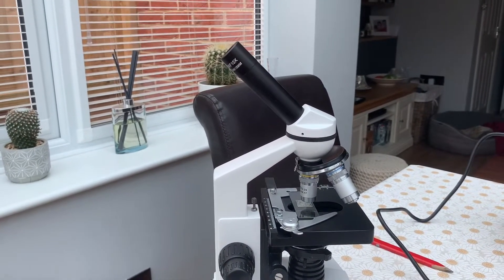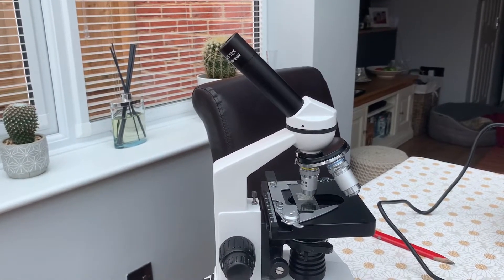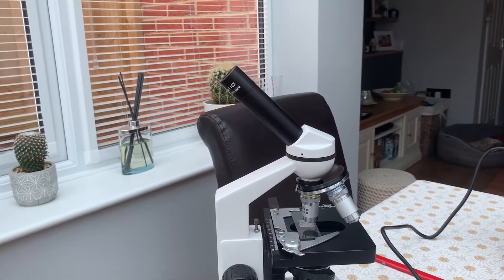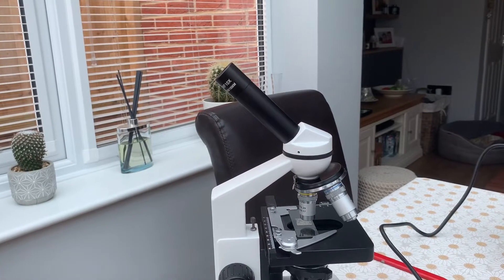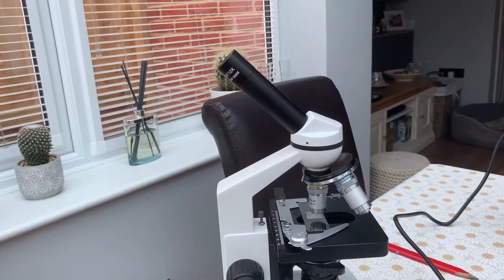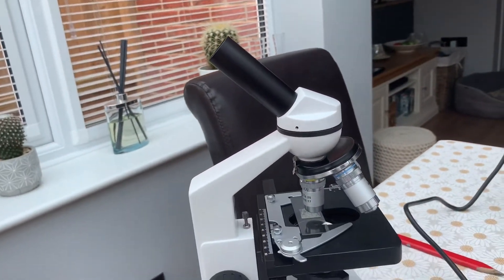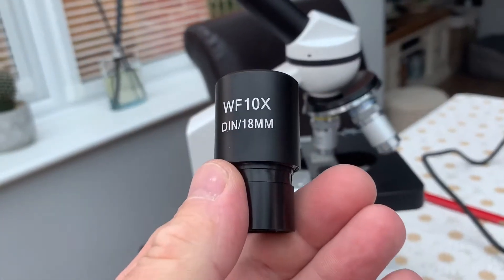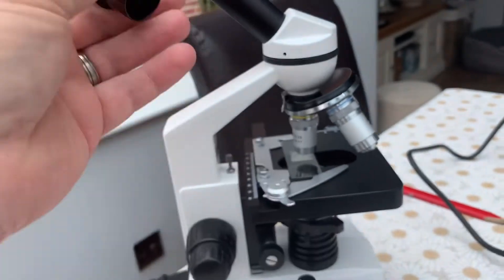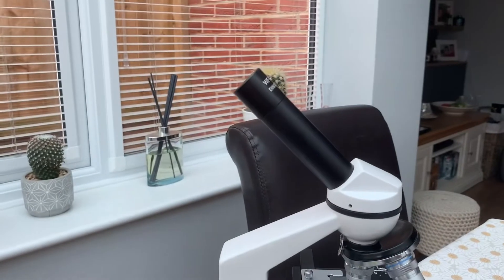Starting from the top, this particular model is a monocular — in other words, it's got one eyepiece. You can get binocular ones; they tend to be a bit more expensive, but a monocular is all you really need. You can get USB camera attachments that go in there too. The removable eyepiece normally comes as a times 10 magnification, and you normally get a times 20 as well.